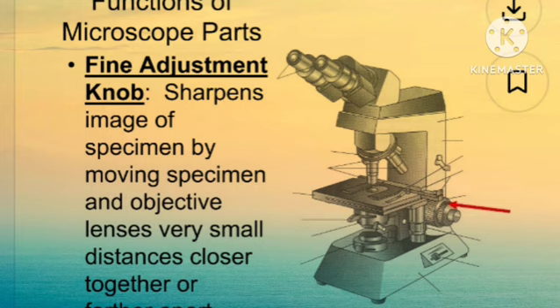It is located directly inside or on top of the larger adjustment knob of the microscope arm.